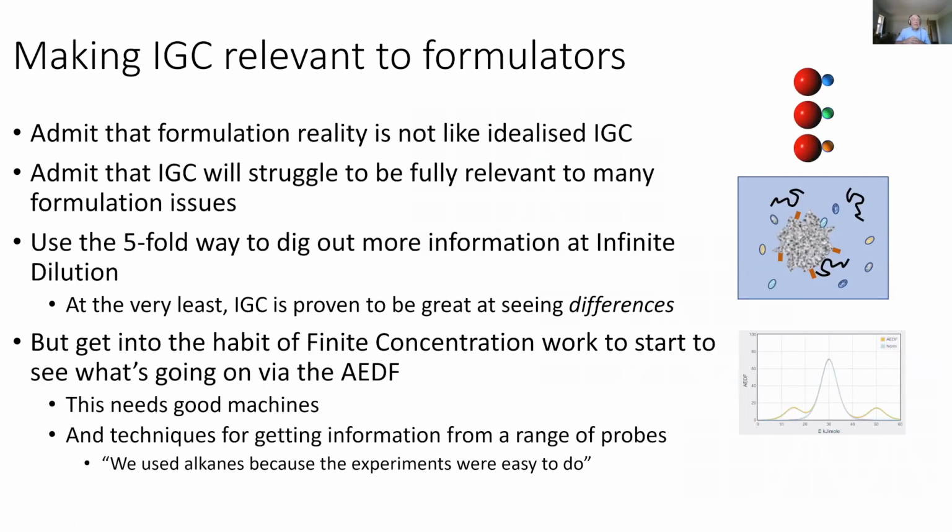So my last slide, making IGC relevant to formulators. We must admit that formulation reality is not this beautiful idealized IGC on these lovely particles with individual molecules. We have to admit that IGC will struggle to be fully relevant to many formulation issues. Use the fivefold way to dig out more information at infinite dilution. At the very least, it's great at seeing differences, but it may be suggestive of hypotheses, as Julien pointed out.